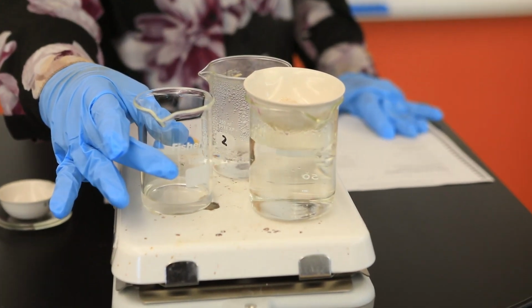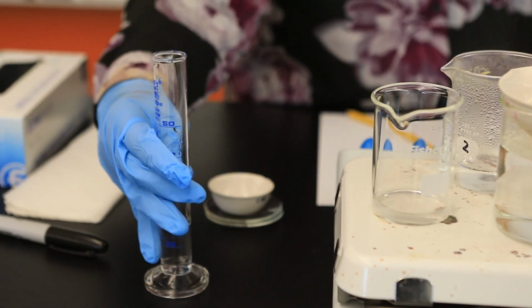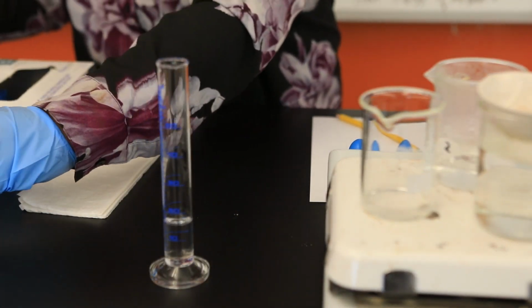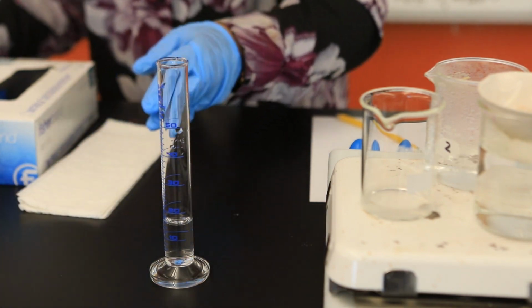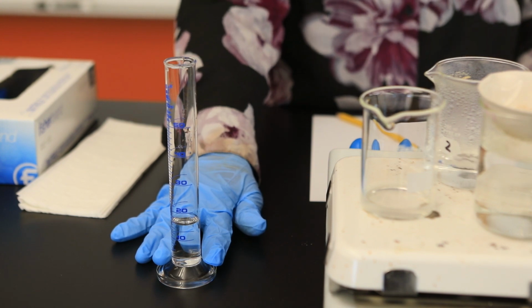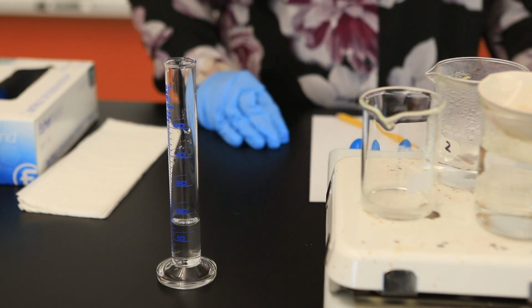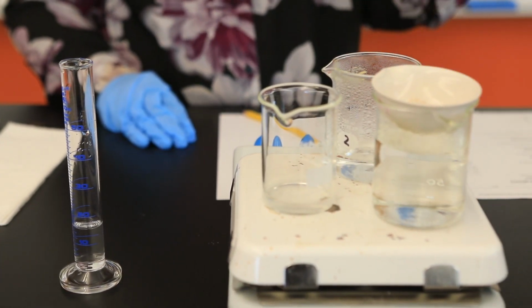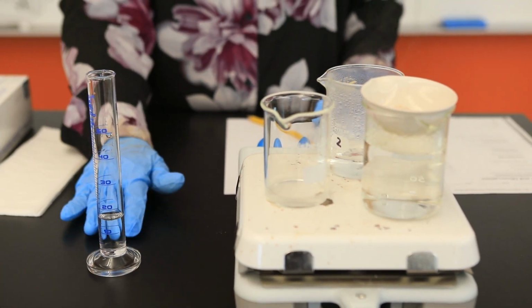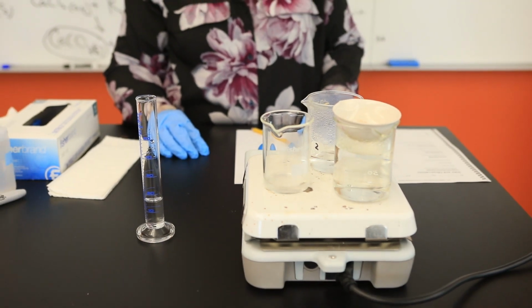Once that process is complete, I'm going to go ahead and add our potassium carbonate solution. That's also a clear, colorless solution. And why are we adding the potassium carbonate solution? It will be to do what? To recover our calcium carbonate. So remember I said that your calcium chloride will react with the potassium carbonate to regenerate, or to recover, our calcium carbonate solid.